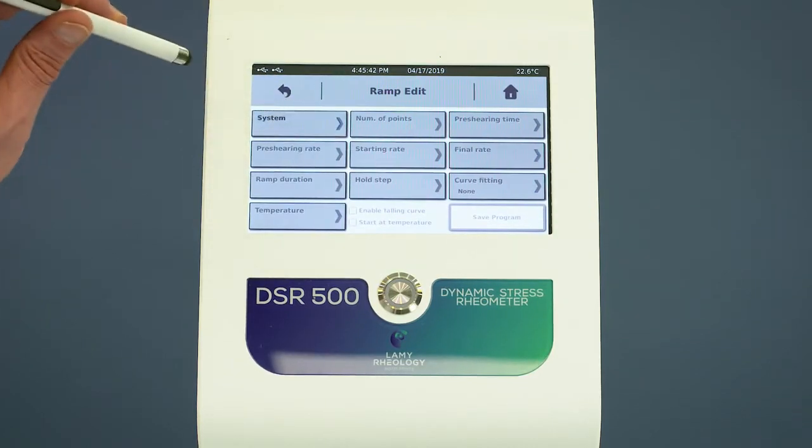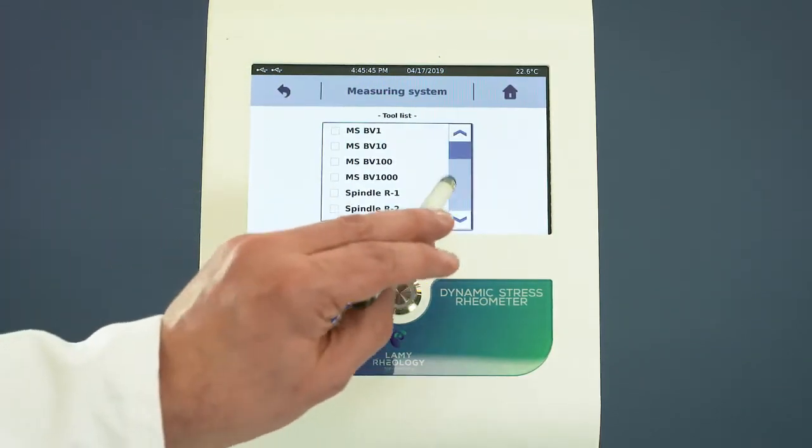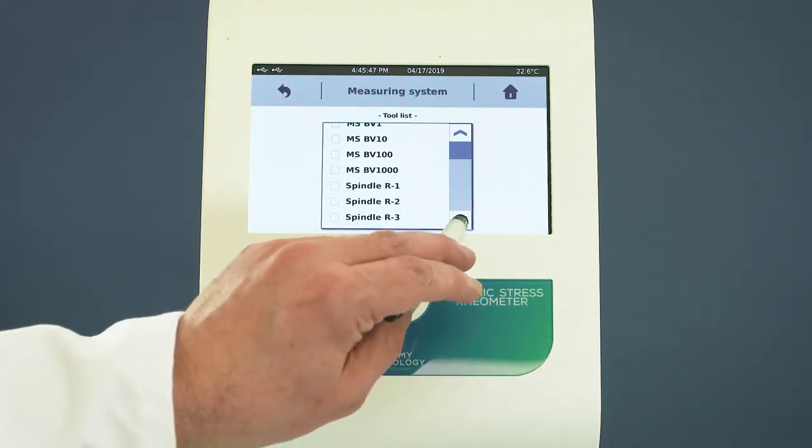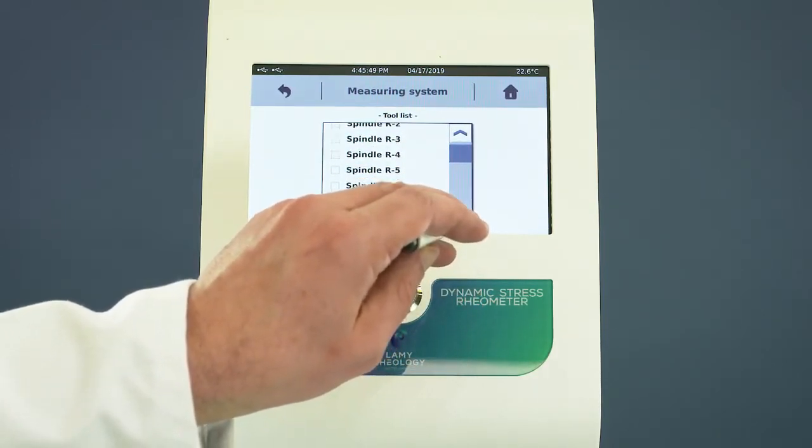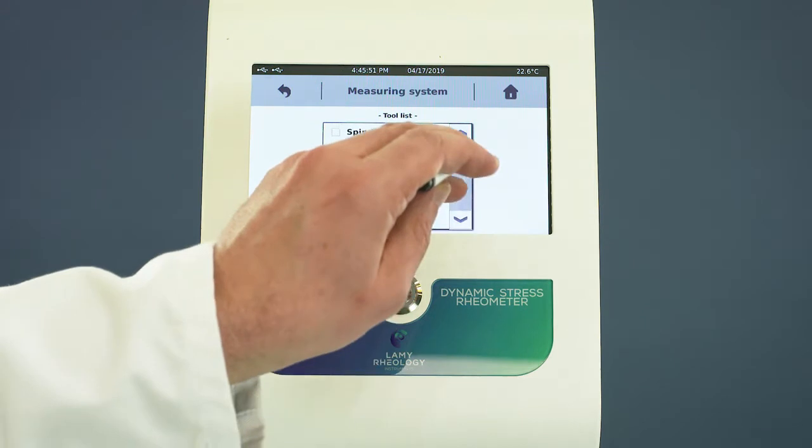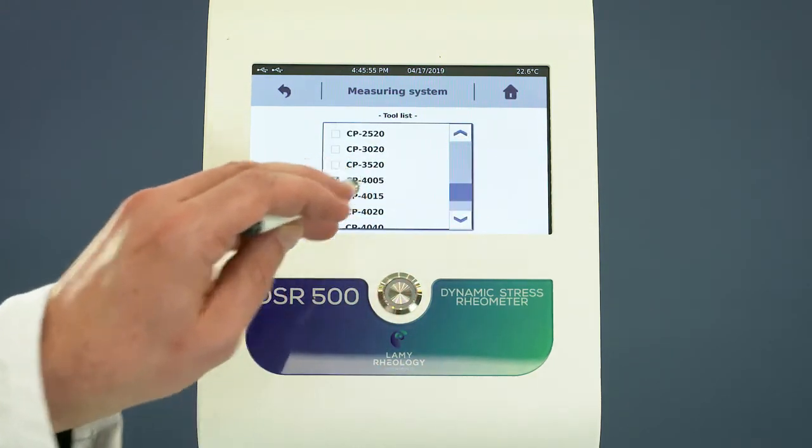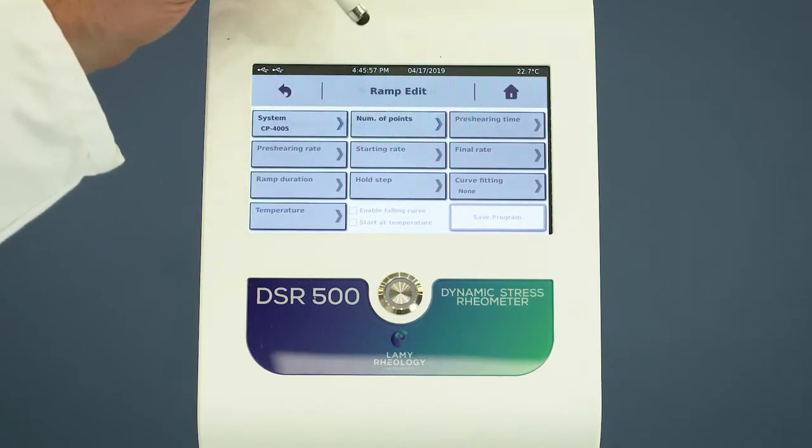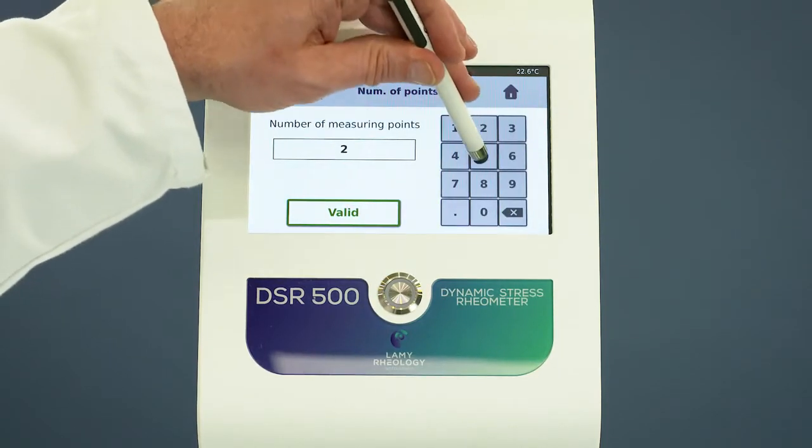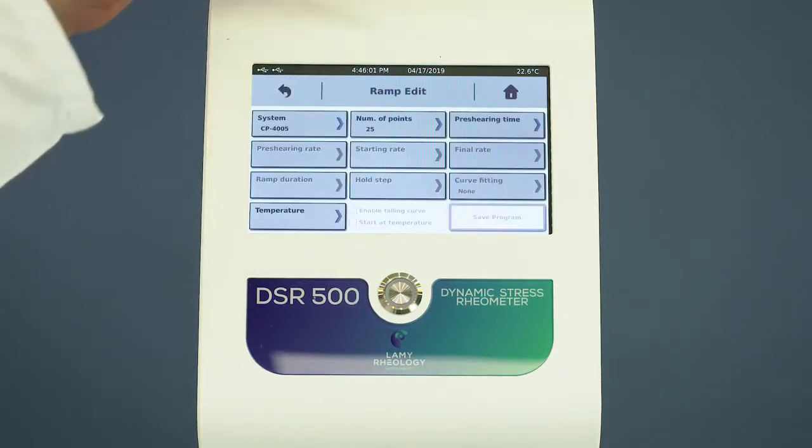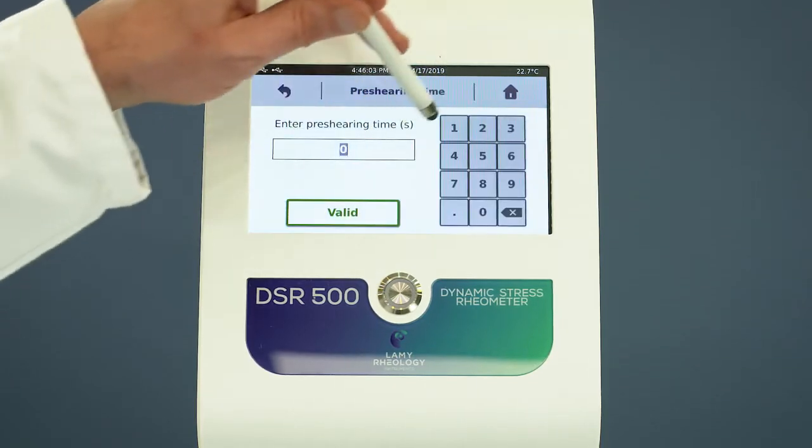Select the measuring system on the list. Set a number of points. Set the pre-shearing phase if needed.